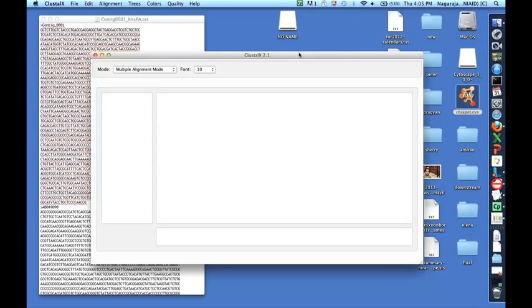For DNA sequence data that are not protein coding or have a large amount of sequence diversity, including multiple indels, inversions, and other structural variation, then the global sequence alignment algorithm in ClustalX will not give you a usable multiple sequence alignment.